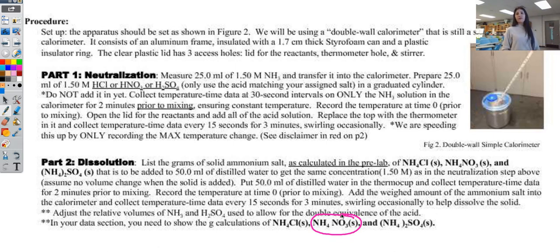You don't have to worry about the sulfate. So it says adjust relative volumes for sulfate. We're not worrying about that. Okay, so that's the procedure.